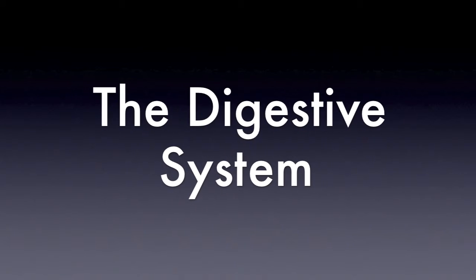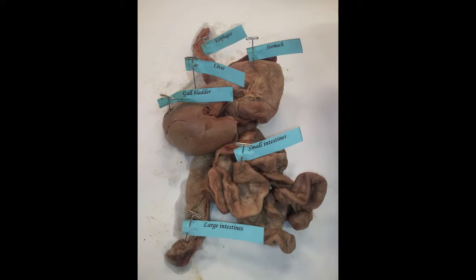The digestive system. The esophagus serves as a passageway for food from the mouth to the stomach using muscular contractions. The stomach receives food from the esophagus. It uses proteases and hydrochloric acid for the chemical digestion of food.